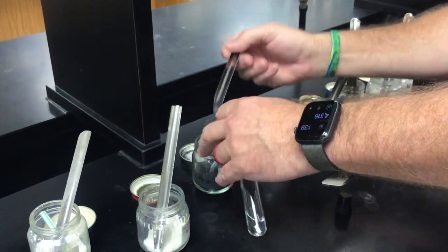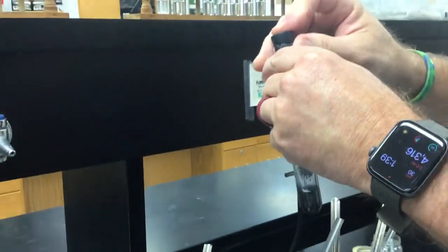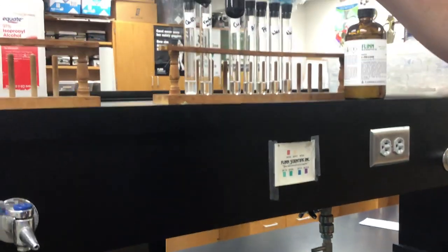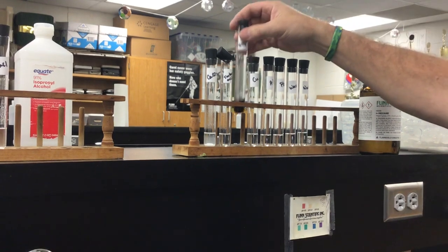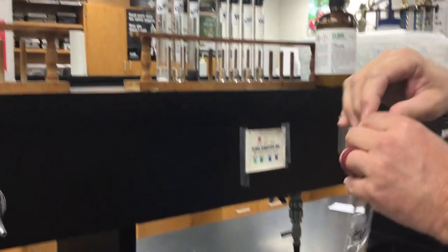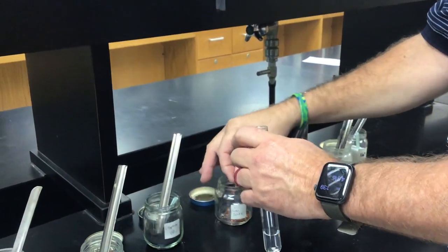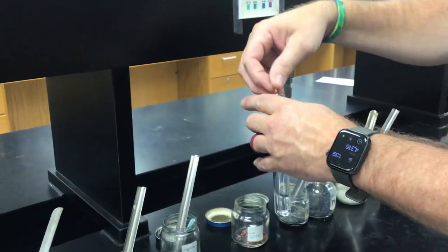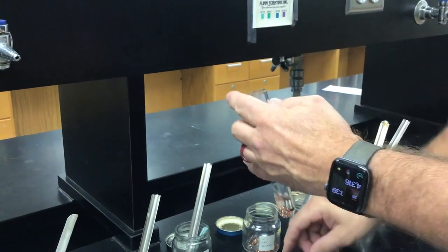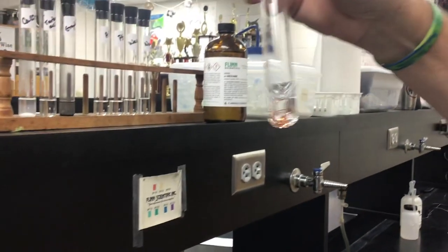Too much. There we go. A little bit of graphite in there. We'll let that sit for a bit. Ooh, losing a stopper. All right, and we'll put some copper in this as well. Oh, that's a lot of copper. Let's do a little bit there. There we go. A little copper in that hexane.